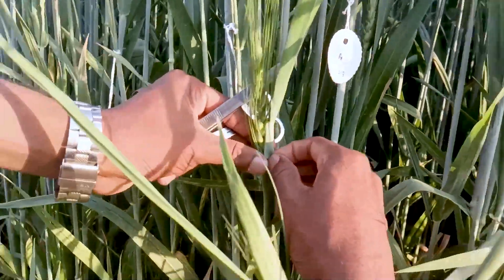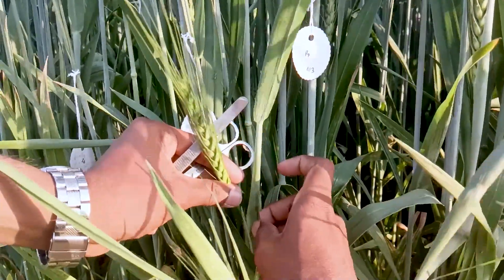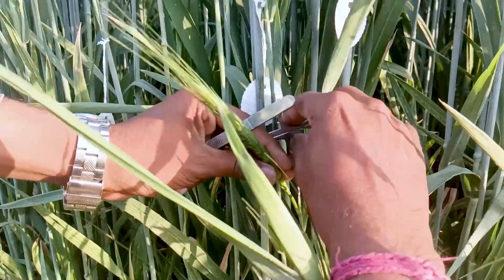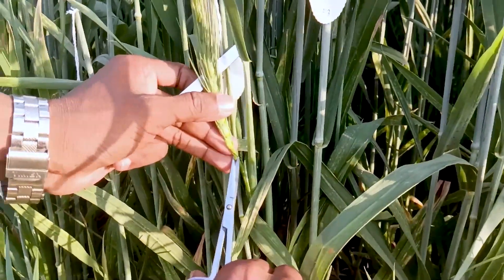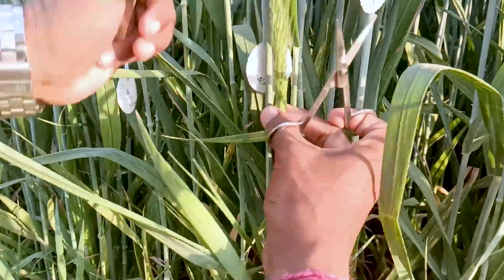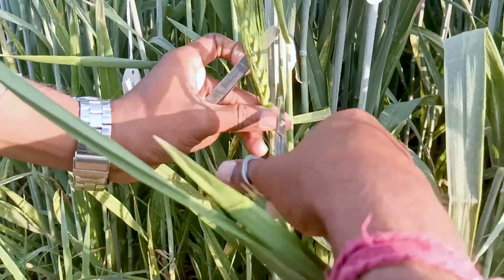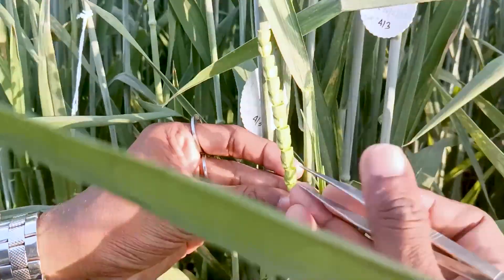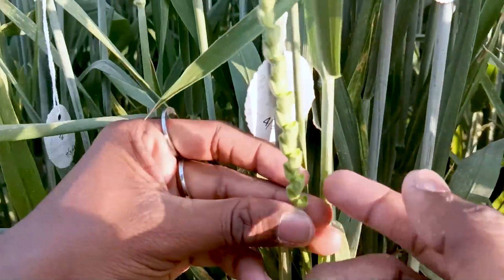First we have to gently remove the flag leaf so that it is not damaged, because it plays a very important role in the photosynthesis process. Now we have to cut down the immature spikelets, then cut one third portion of each of the spikelets. So we have cut all the spikelets to one third portion.